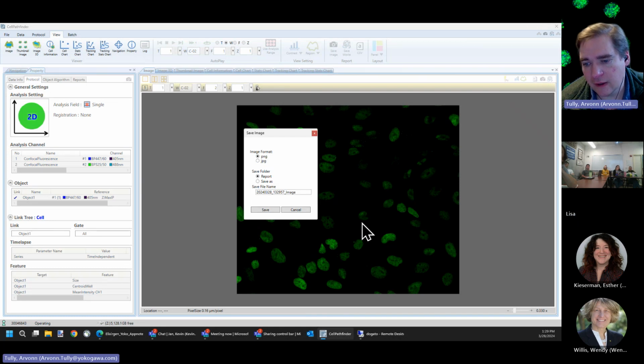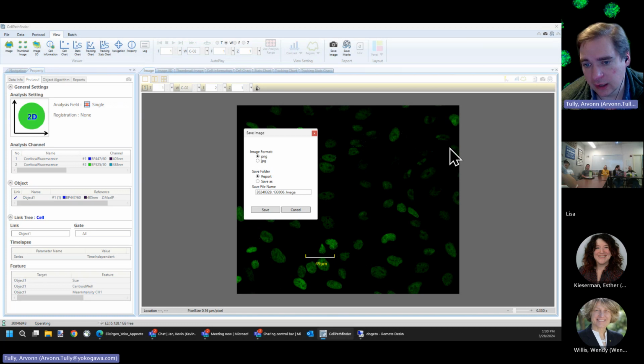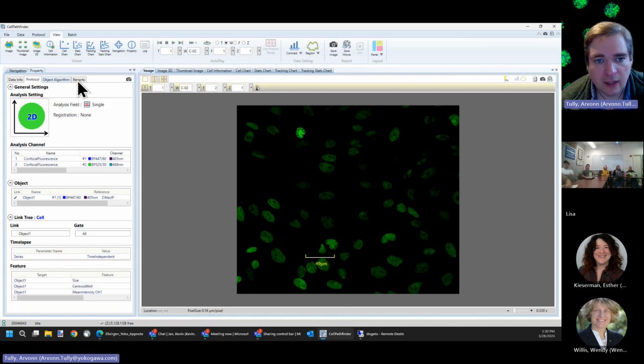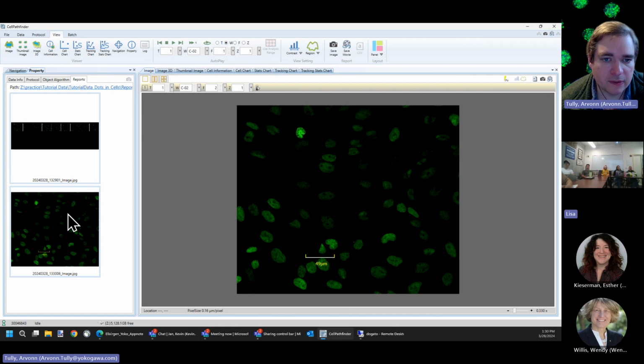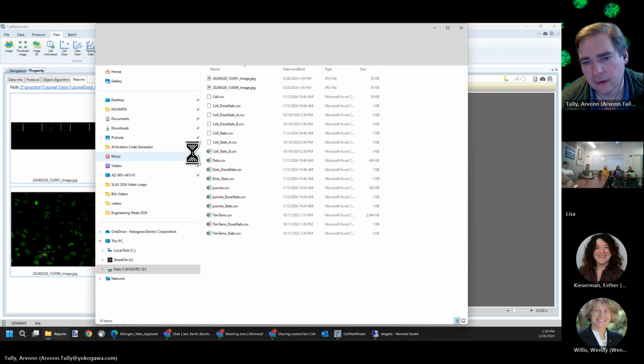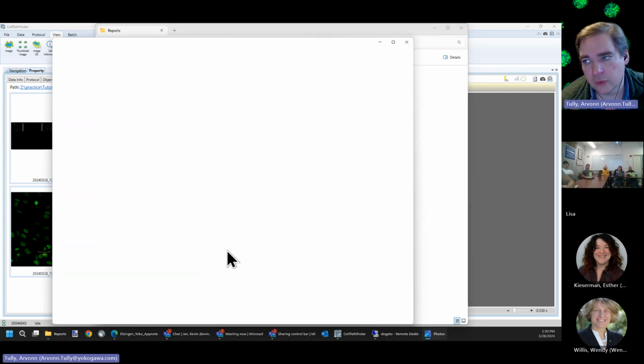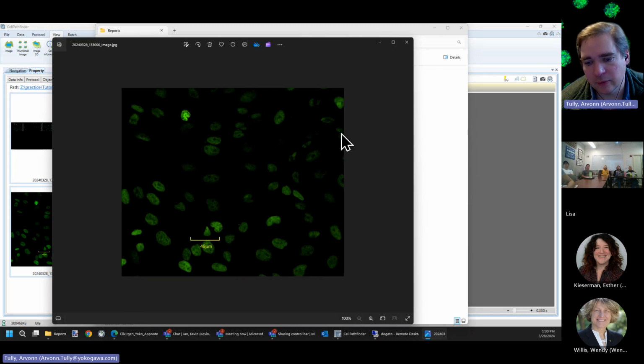So in this snapshot, there's no scale bar that gets added unless you right click and set add scale bar. And then we put this on here. And then if you do a snapshot here and it says PNG JPEG, let's save it as JPEG and I hit save. And if I go to my reports and I open this report up, cool. Then it will get saved right there. So that saves exactly what you see.